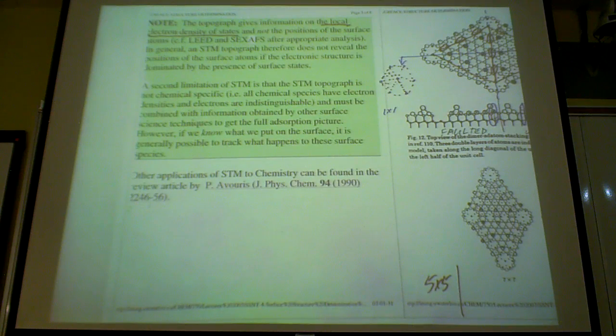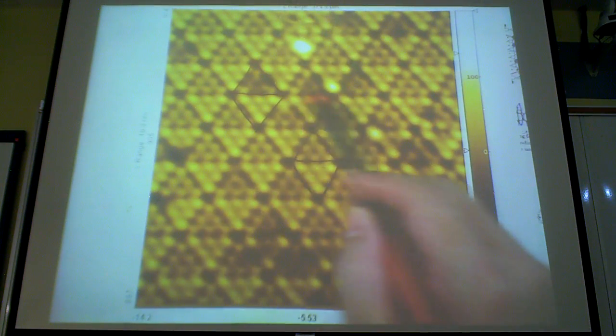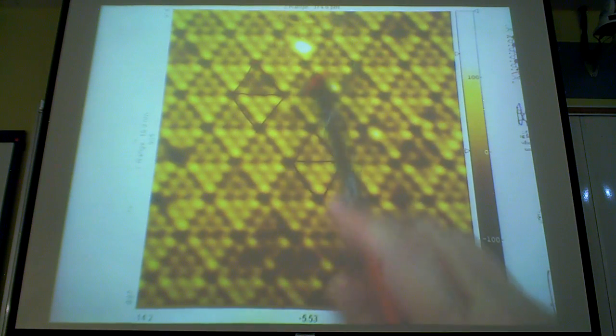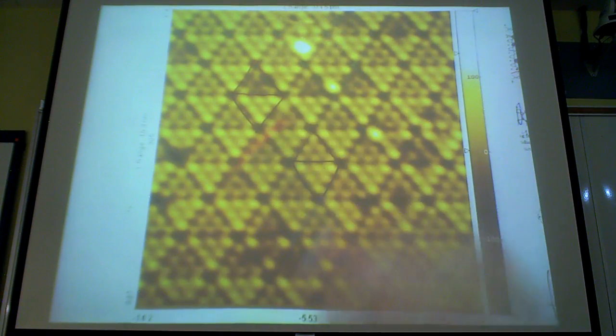And furthermore, let's say you are building a nano object with this STM microscope. You're talking about atomic spacing here, about atoms. Once you build this thing, how do you find it again? You have no tool that you can use to relocate it. Let's say I build a little atomic structure here, this little triangle that I have. Once I take my sample out, I have no way of finding this again, because this is atomic resolution. The surface is vast. You have no way of finding your device again if you build a device on here.